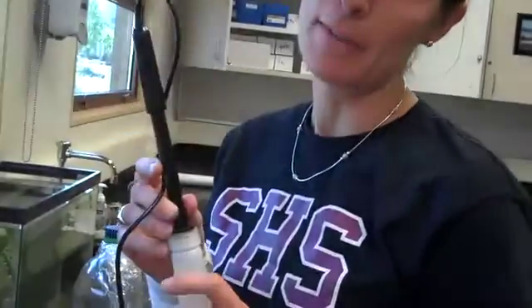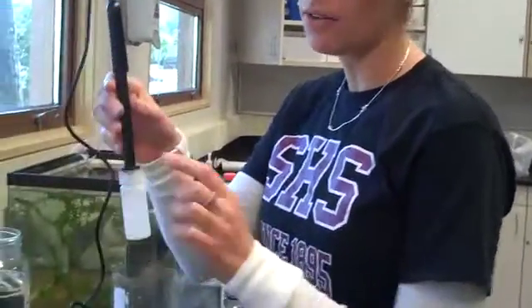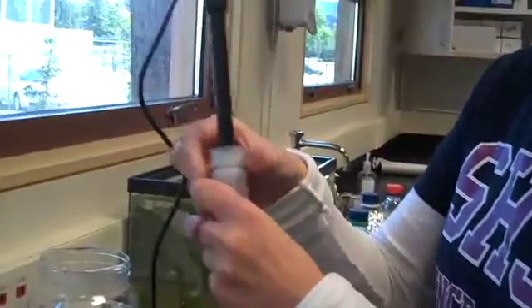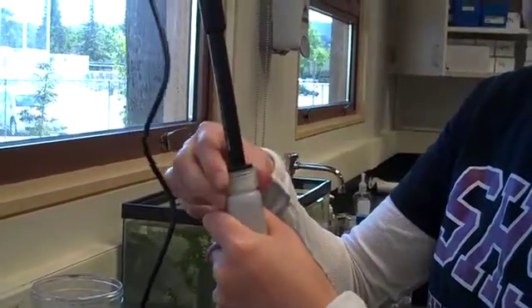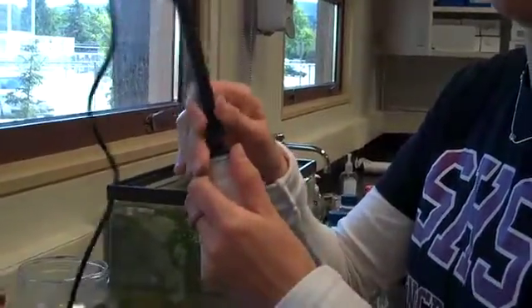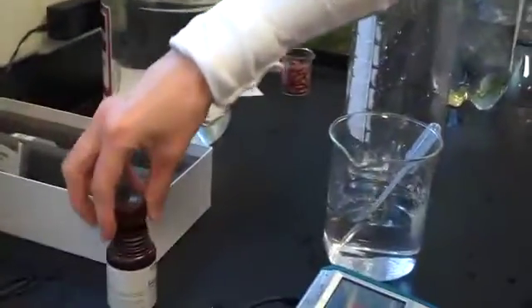Our probe has been warming up for about 10 minutes and now we're going to calibrate it. You want to take it out of the distilled water it's been sitting in. You just want to unscrew the lid a little bit and that will allow you to pull this out from the suction. And we're going to place it in the sodium sulfite solution.